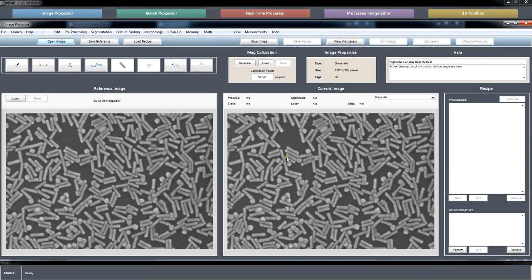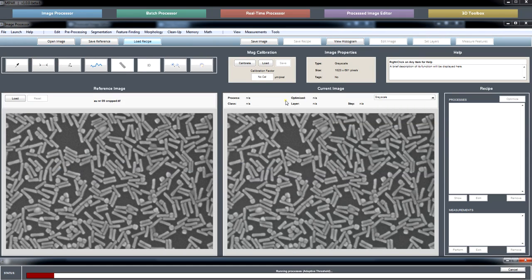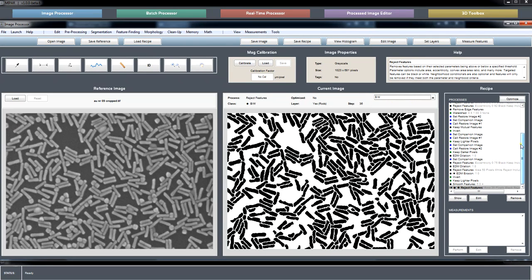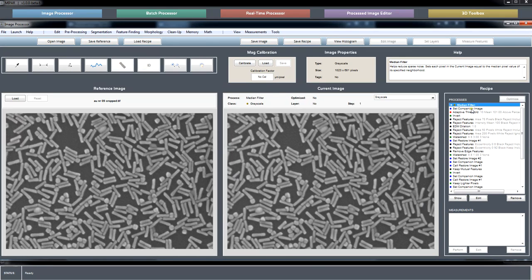These features are all the same intensity level, but they wanted the rods separated from the dots. So what we ended up doing is this deal. Oh my goodness, 36 steps. Wouldn't have thought.